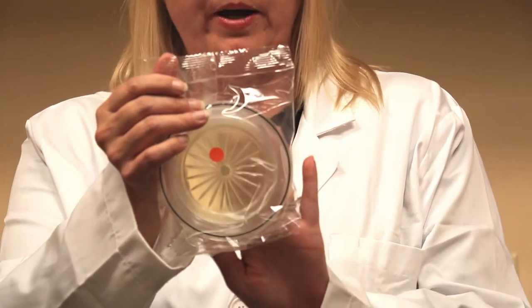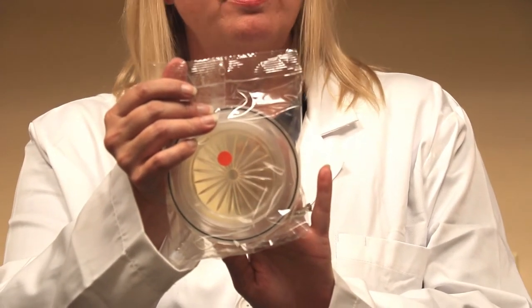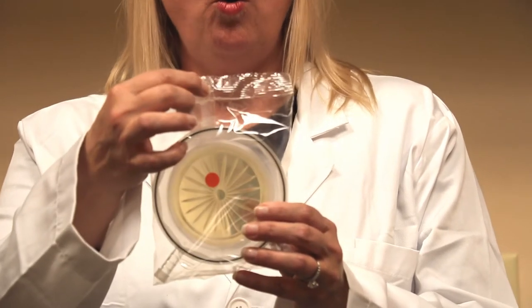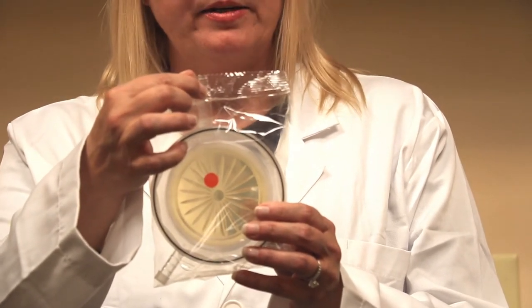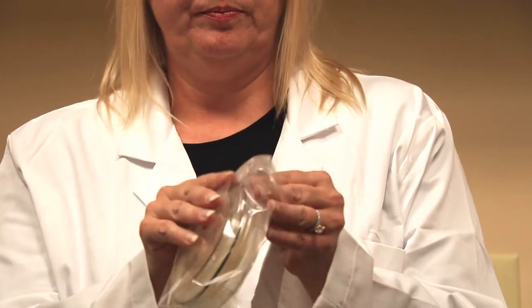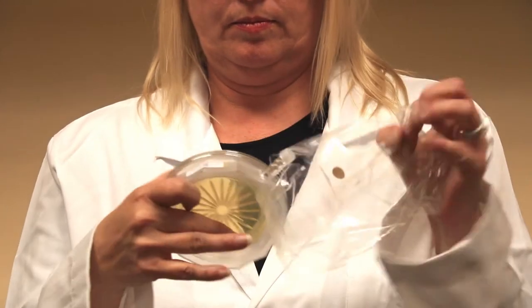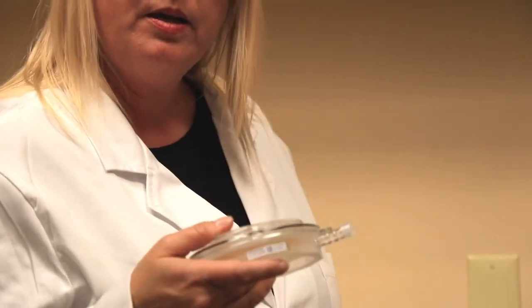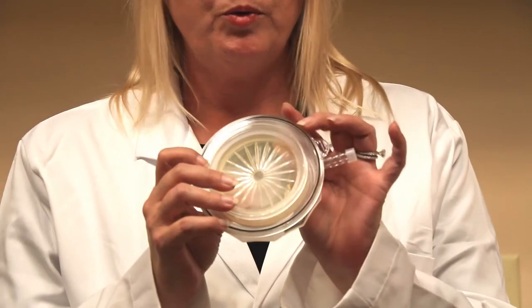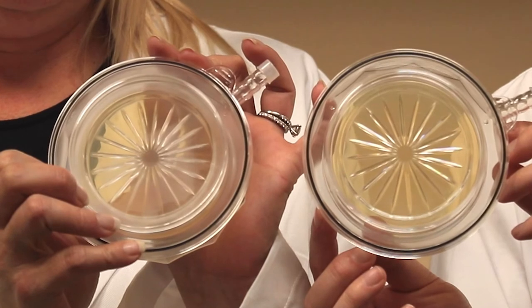I'm going to open this BioCap Single Use 100 liter per minute and show you what this looks like on the inside. Before I do, notice there is a hole on the packaging — this means that you can hang it. This outer packaging is VHP resistant. And you can see the BioCap Single Use 100 looks exactly like the BioCap Single Use 25/50 liter per minute.